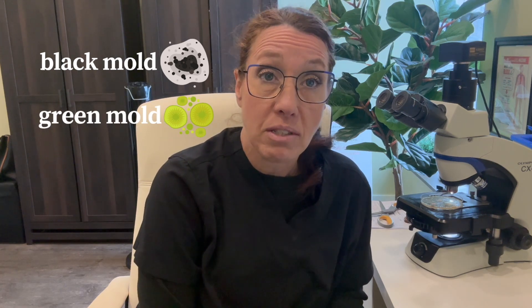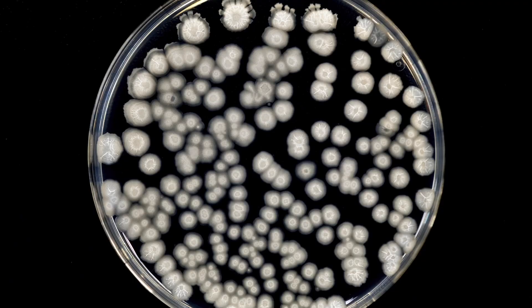This is day five of growing bacteria on our phones, and we've grown some pretty interesting things. On screen I'll be showing you that somebody grew some black mold — we've also had some green mold grow, which we looked at in the previous clip. The black and green seems to look quite similar on screen. We've also had some red bacteria grow, some kind of peach color, and then a lot of milky white bacteria, which I think is a simpler bacteria that we see commonly in live blood from surfaces. Then I'm going to give you some tips on how to keep your cell phone clean.